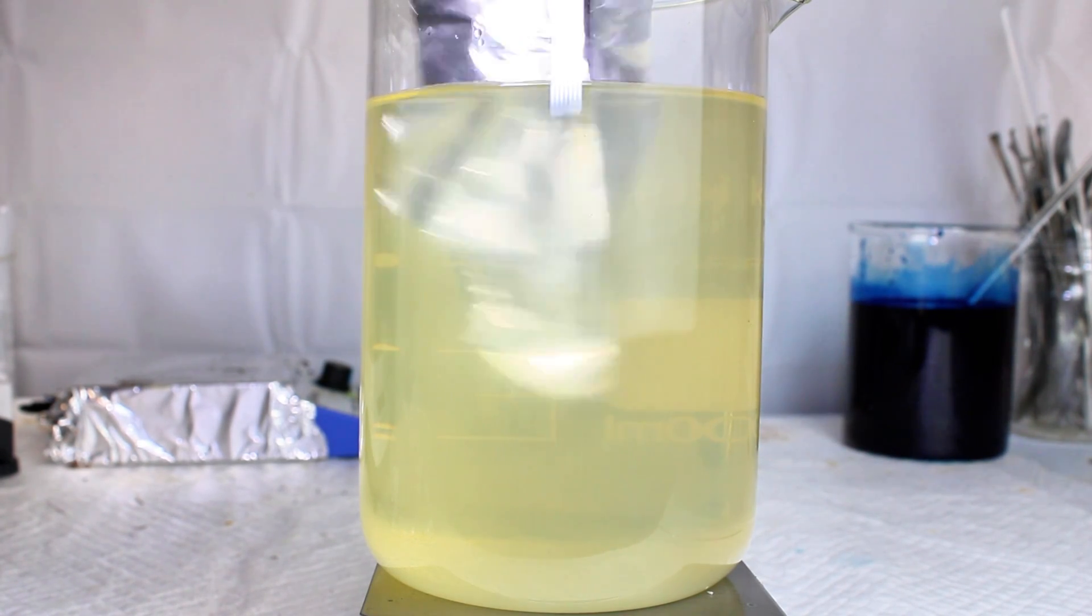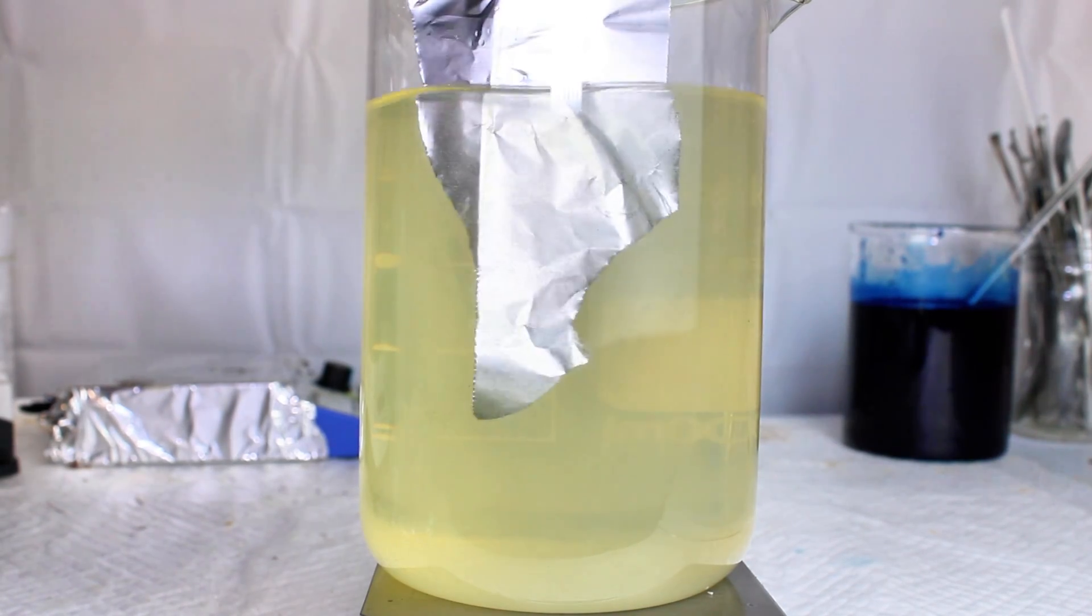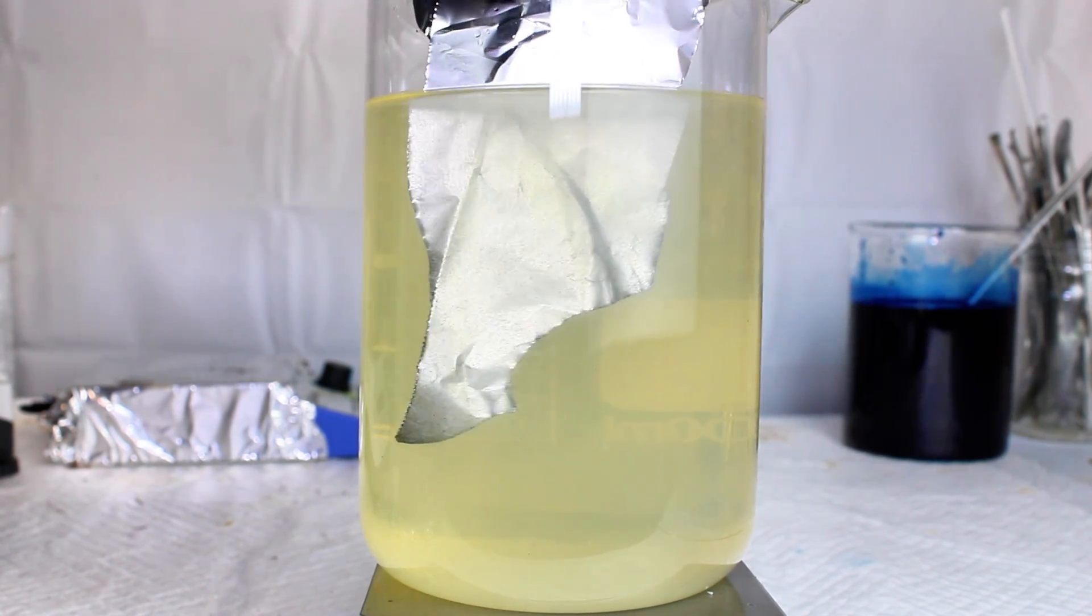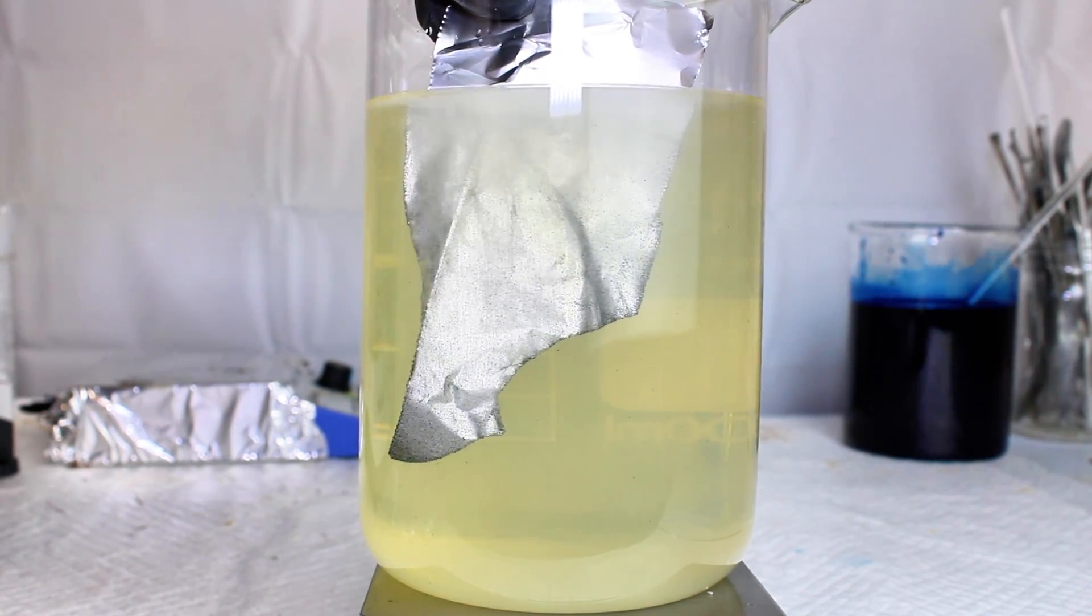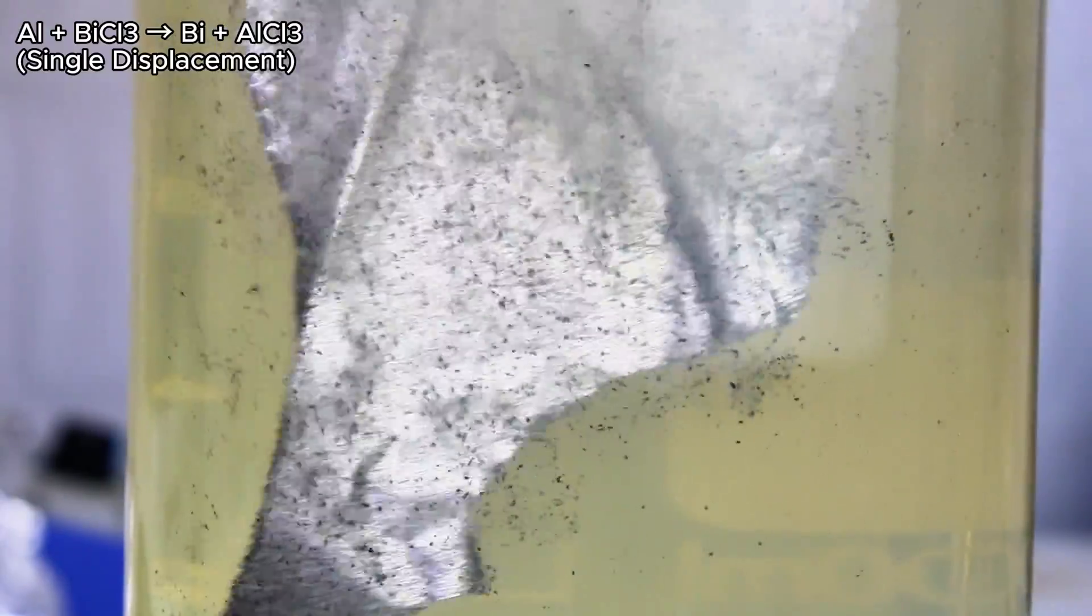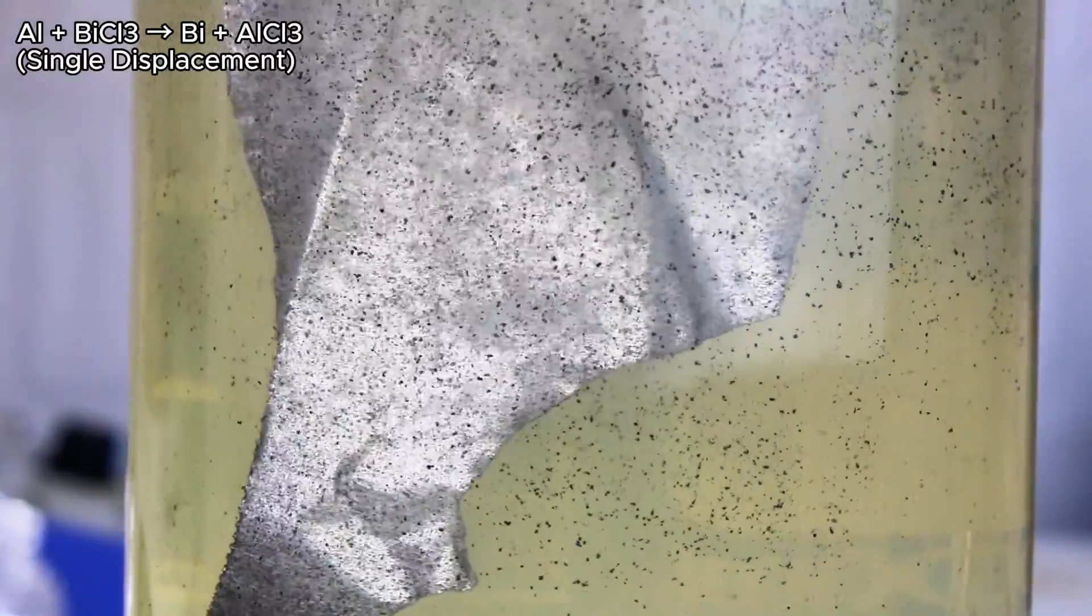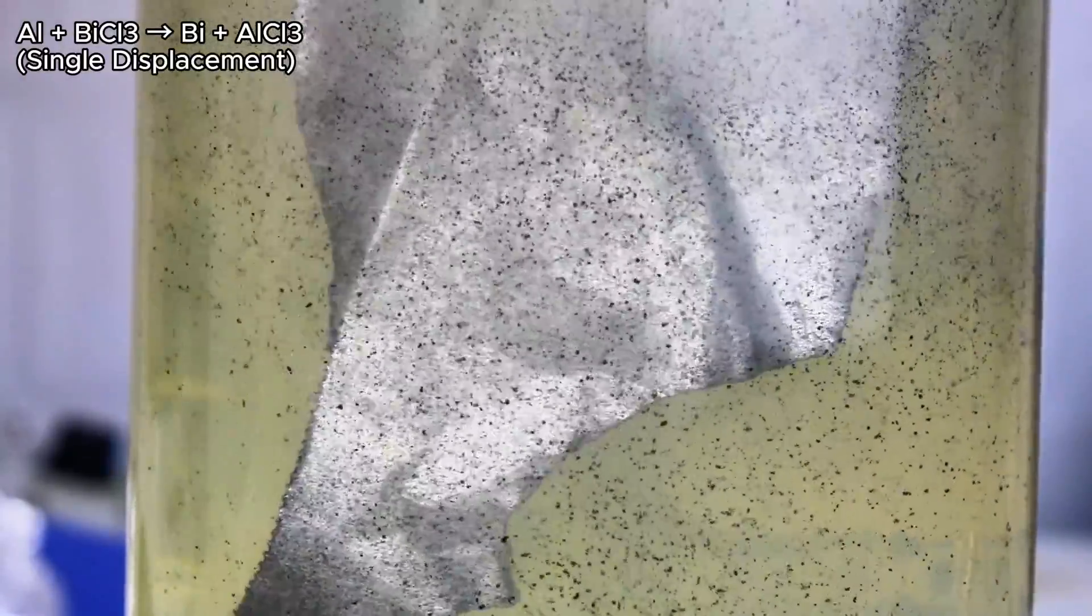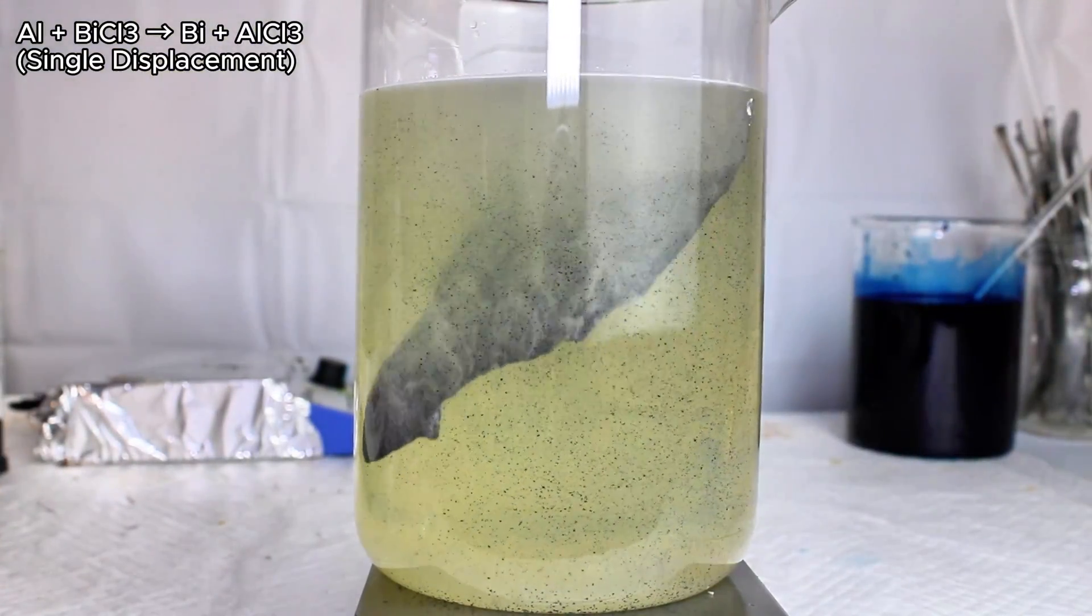Converting bismuth ions to bismuth metal from this point is fairly easy. I diluted it with distilled water to prevent the reaction from getting out of hand, then tossed in some aluminum foil. Aluminum is a strongly reducing metal compared to bismuth, meaning it's very electropositive and has a much greater affinity for electronegative chlorine ions than bismuth does. The chloride ions will leave bismuth and bind to the aluminum, which displaces three electrons from the aluminum. These electrons will immediately replace the three electron deficit of the ionic bismuth and produce elemental bismuth metal, which appears as little black specks that settle to the bottom of the beaker.